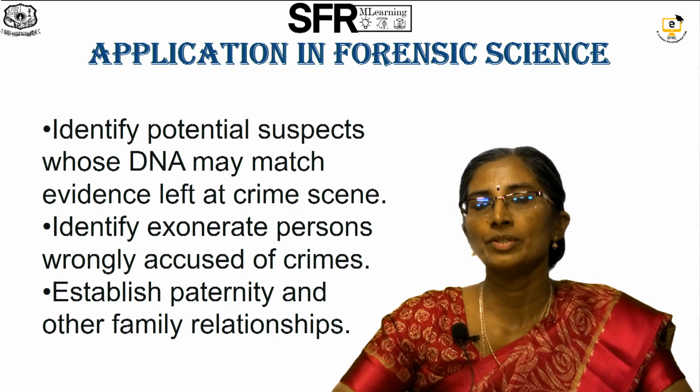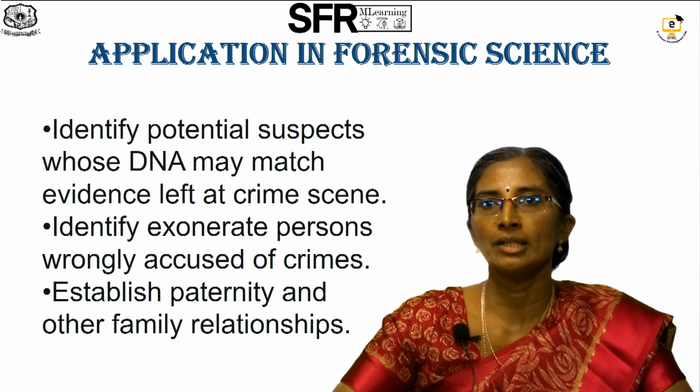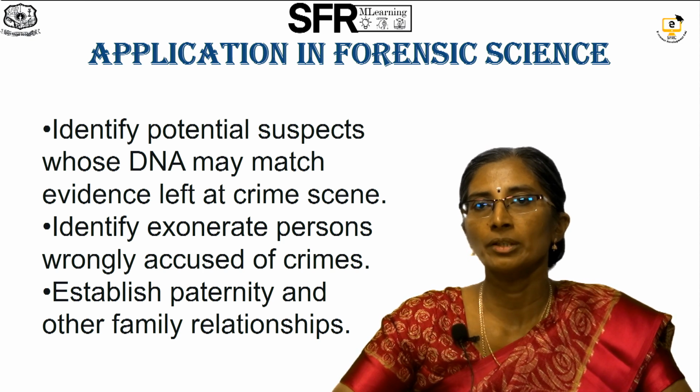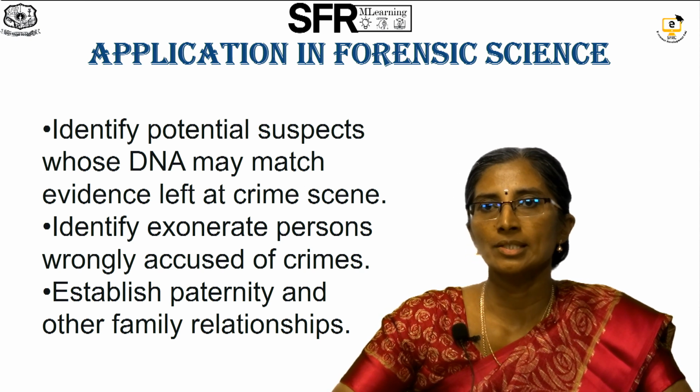And the experiments for which the DNA analysis is done are, first, for a suspect. If you are finding a suspect in the crime scene, their DNA has to be extracted and DNA analysis has to be performed. Other than that, confirmation of the accused or the suspect, and solving paternity and family relationships. For all these crime scene purposes, we are using DNA extraction as a prerequisite experiment. That has to be done carefully, then only the result can be confirmed for forensic science.